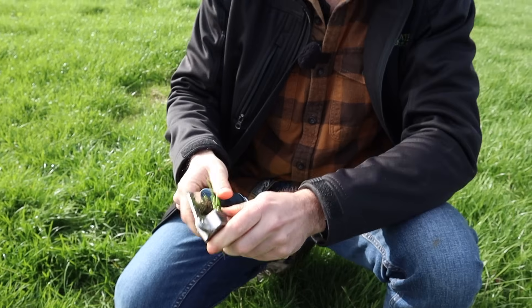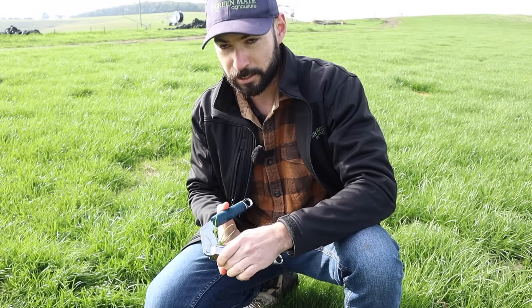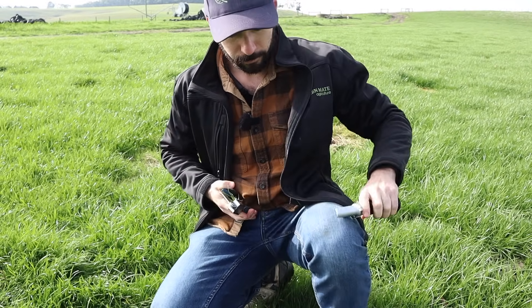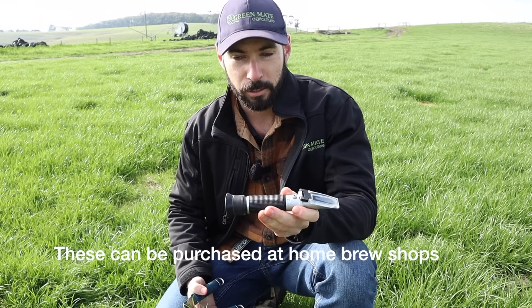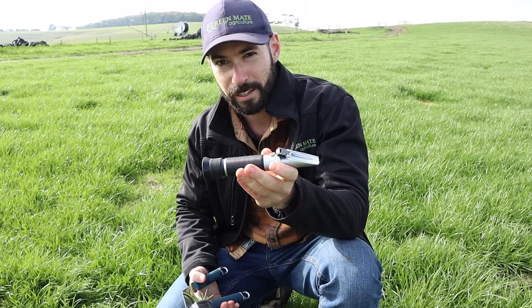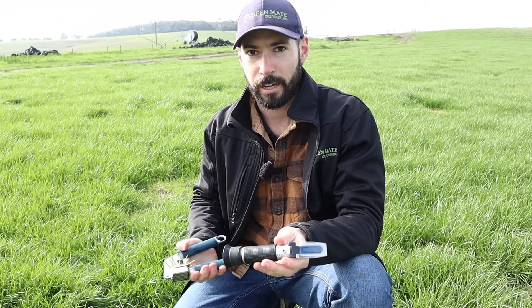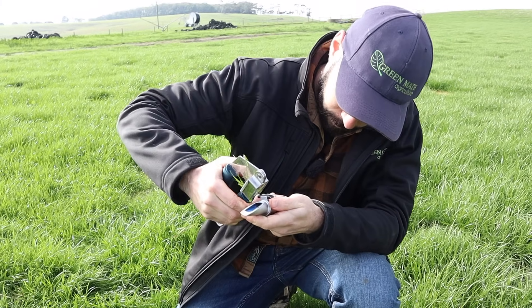This is nothing fancy — just a garlic press from the supermarket. You can get proper brix extractors, but the outcome is the same. This is our refractometer, or brix meter.